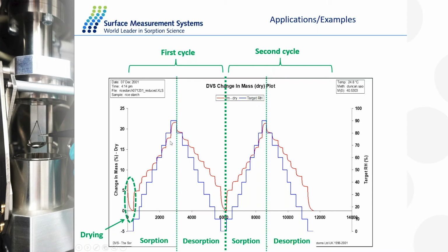In fact, the mass flattens out during the equilibrium stage. The material has quite a high bulk sorption because we are recording about 20% mass change. And the sample is repeatable because we start from 0, we go back to 0 every single time.